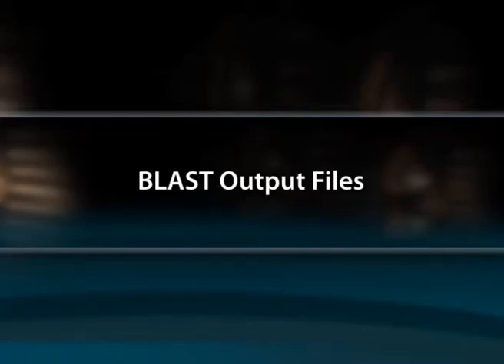Blast output files. A BLAST output file is a very long file having 3 parts. At the beginning, there will be some header information followed by a summary of the alignments, the alignments, and then some additional summary parameters and statistics at the end. Here is a sample BLAST output file which shows the starting, middle and end parts only.